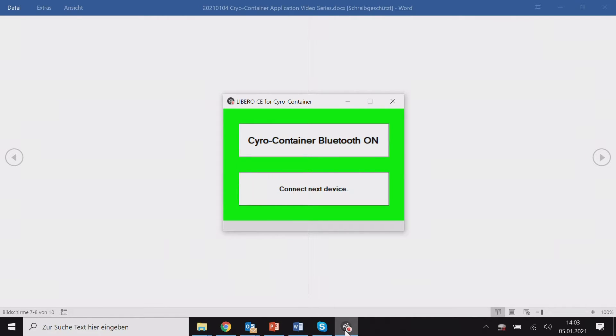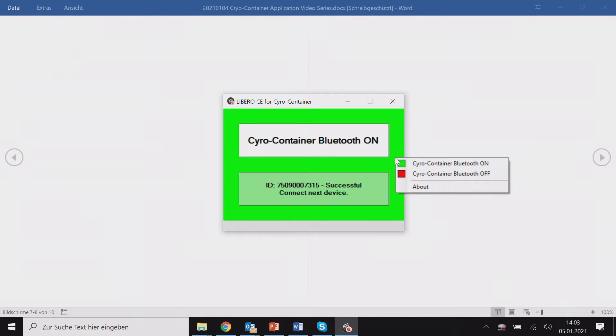Libero CE is a classical PDF data logger and it can be configured via the USB port using a simplified version called Smart Start. We select the profile and simply add the configuration profile. The full version of the configuration utility includes over 100 different configuration options and is only recommended if you have training.